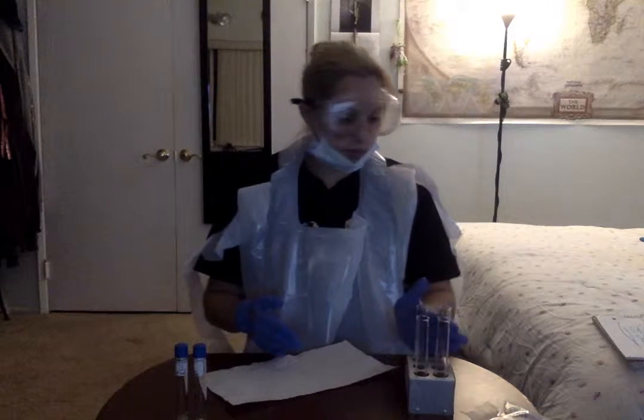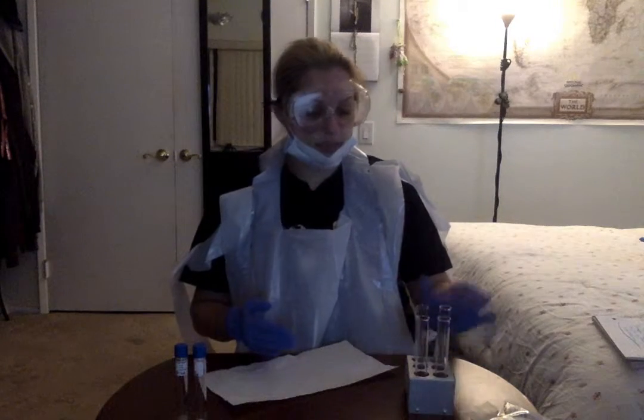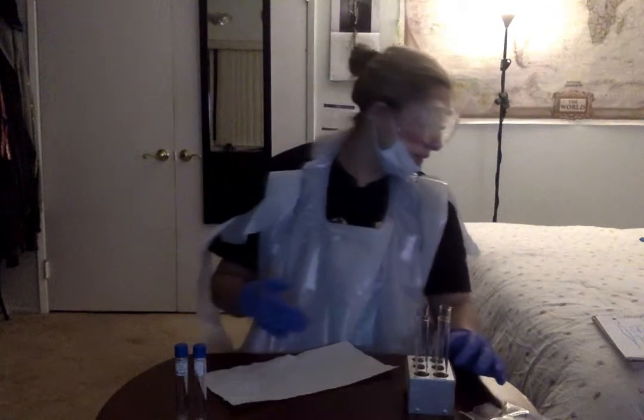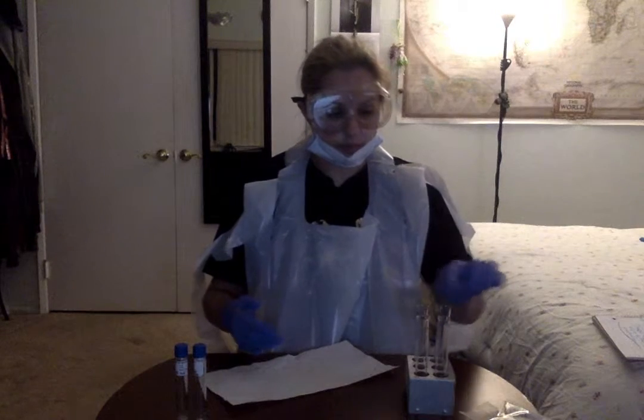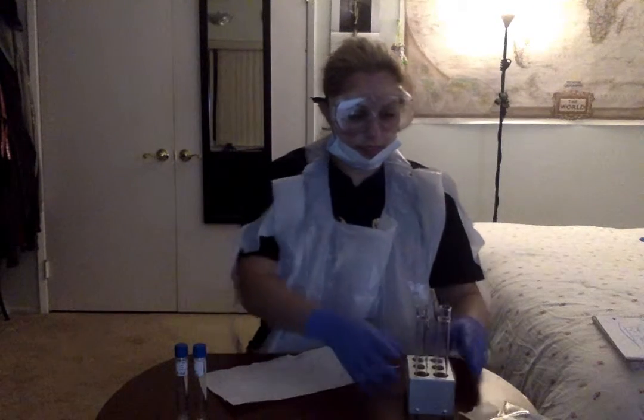And basically that also means that this did test positive for fermentation, specifically, I can't pronounce that word either, butanediol. So that's for the Voges-Proskauer test. So that was that.